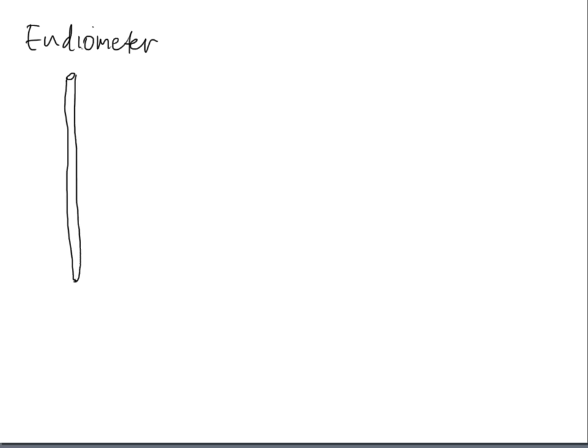All right, so what is a eudiometer? This is my awful hack job of a eudiometer. That's what this thing looks like. I want you to think of a eudiometer almost like a burette. It is not made the same way, but as far as shape goes, it's very similar. These are very long, and they could be the length of a burette that you use in a laboratory.